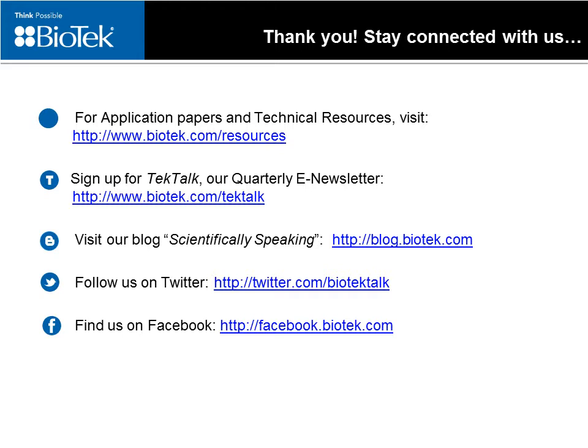A question about the high contrast bright field replacing phase contrast. You can actually run both of these at the same time. So you could run a proliferation experiment in which you use high contrast bright field on some of the wells or some of the plates and phase contrast for others. So you really have a whole lot of flexibility as far as what you want to analyze for a given experiment. The high contrast bright field does not exclude the option to use other imaging methods within the same experiment. You're only limited by the objectives that you have in your instrument.